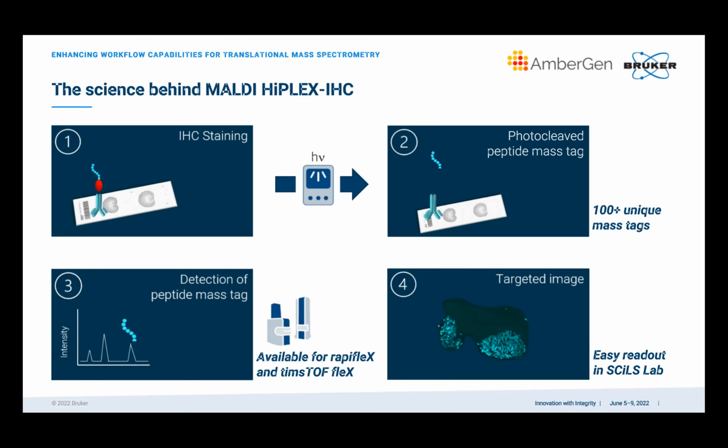So the question was, how do I get information from a MALDI imaging experiment? If I have a known protein marker, is that what you're saying? So if I'm doing a metabolite experiment, that's where doing that segmentation analysis is really critical. You have to start by saying which cell types are expressing similar compounds.